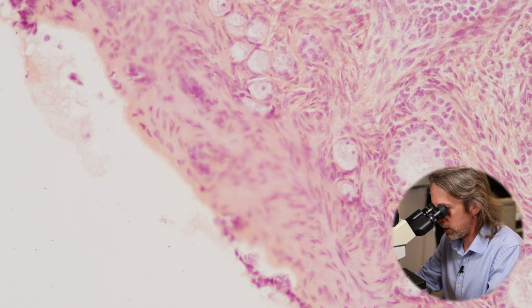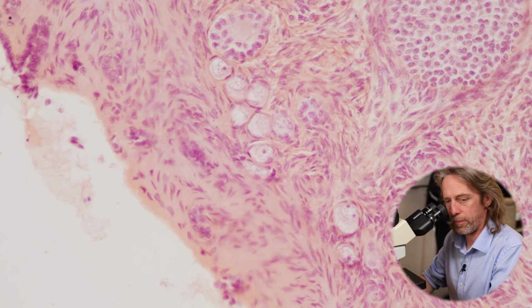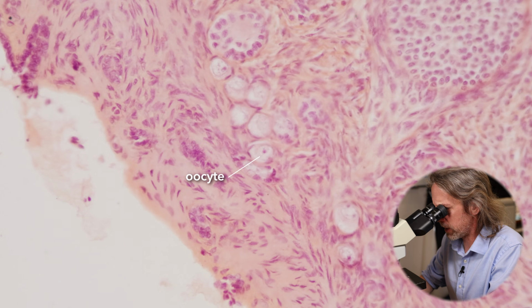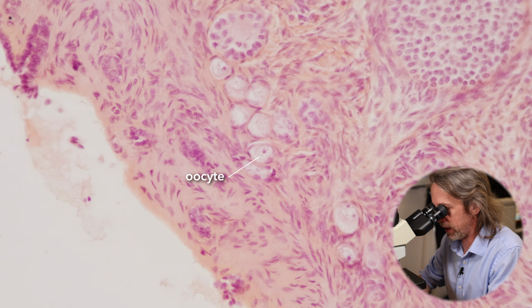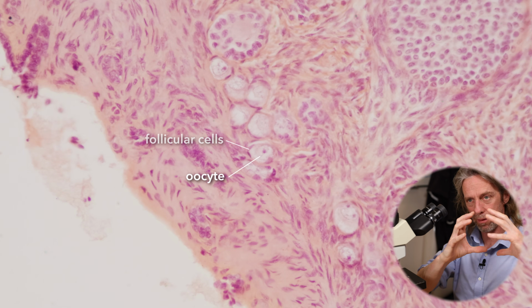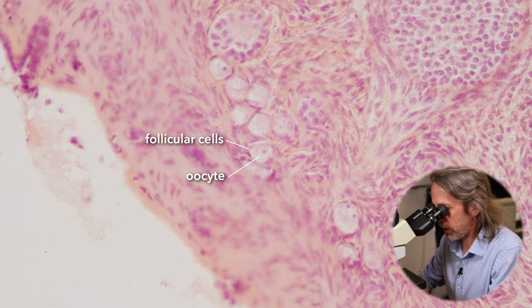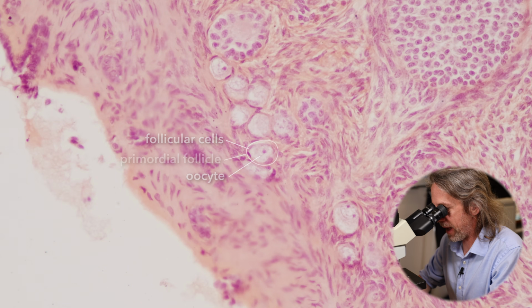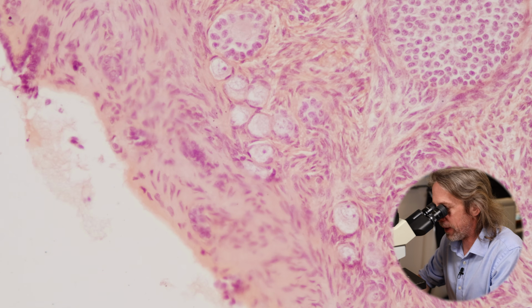All right, so if I zoom in, this is my 20 times objective. And we can see some large cells there. So with a central nucleus, quite a lot of cytoplasm around the outside, a bit like a fried egg. And you might imagine that there are some squamous cells, some very thin, flat cells wrapping around that. So that is the primary oocyte, and that is a primordial follicle. So the cells surrounding it are follicular cells, and that's the simplest form.